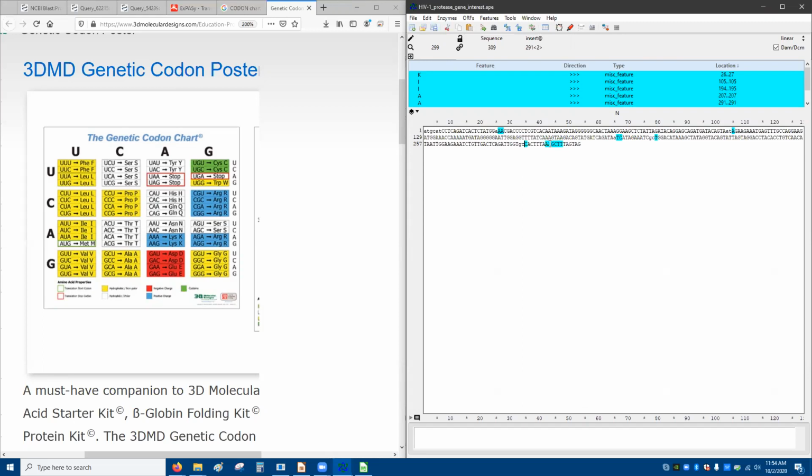There you are. So AAT, or AA something, AG. So we just need to change this to a C. Good. You could also do AAT. Can help reduce issues with improper annealing.